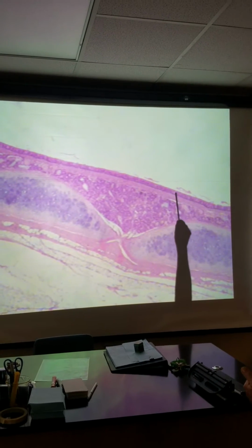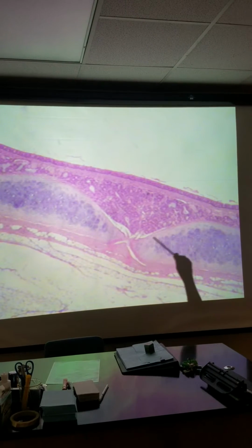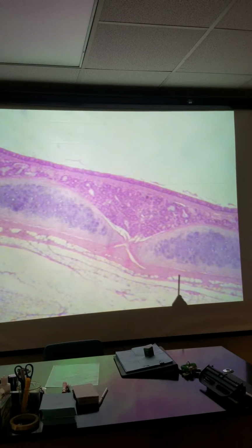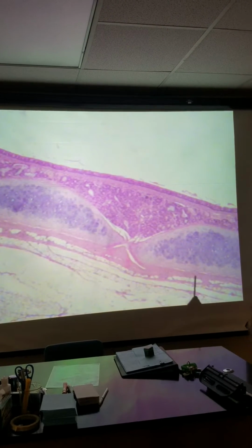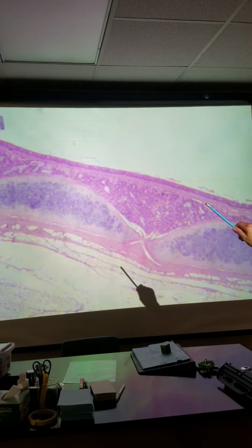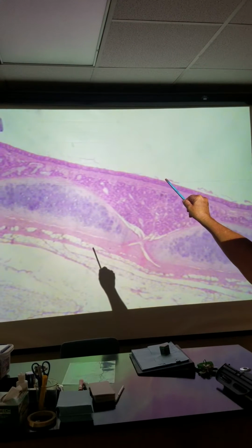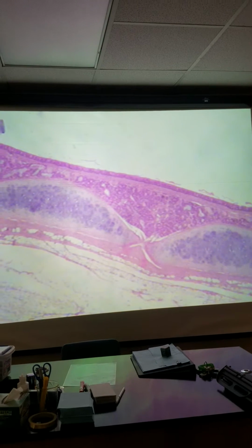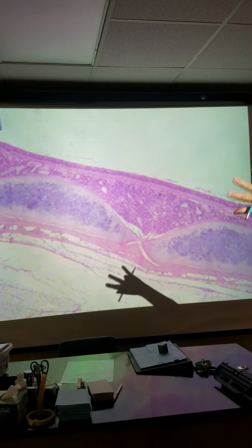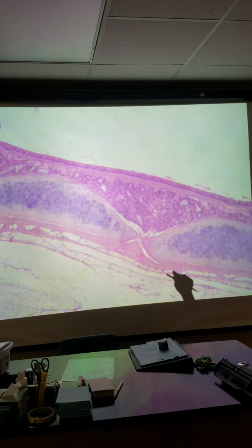So here's your mucosa. Below this dark line here becomes submucosa. This, of course, is hyaline cartilage. And then anything outside of the hyaline cartilage here in this pink kind of a tissue is going to be the outer connective tissue of adventitia. And you know this is the outside because what is this? This is adipose connective tissue. Remember, fat tissue stores energy, cushions, and insulates organs. So that gives you an indication like outside, inside, right? Mucosa, submucosa, hyaline cartilage, and adventitia.